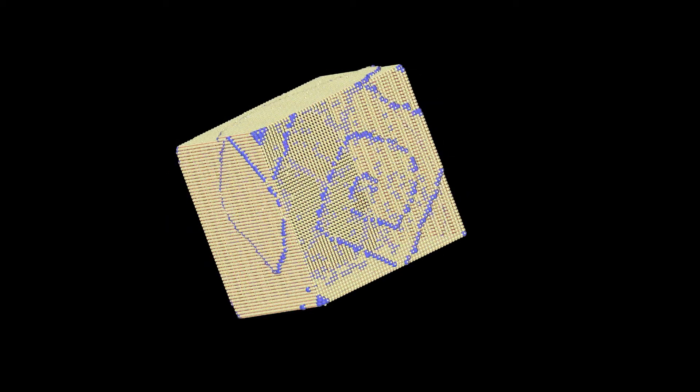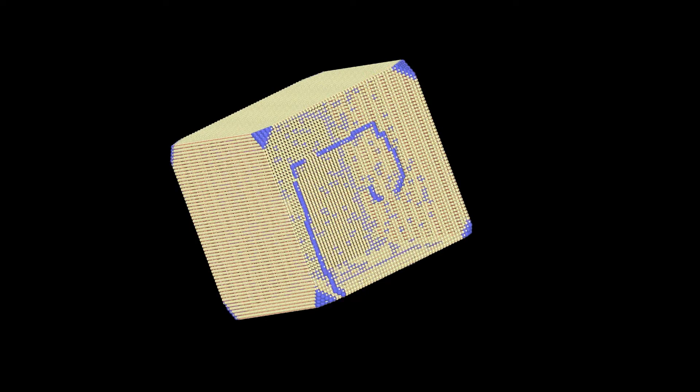Screw dislocations can be added along any crystal direction. Internal defects often occur within the crystal volume, and these are generated spontaneously by Crystal Grower.